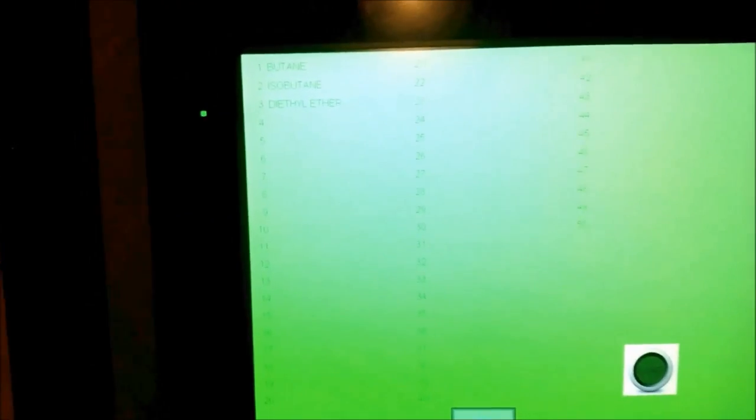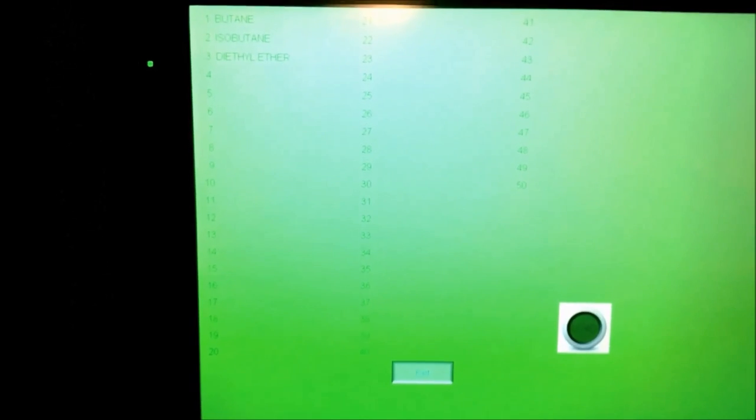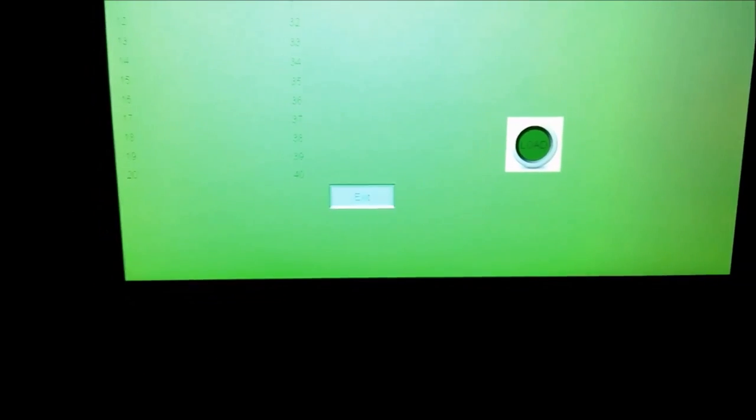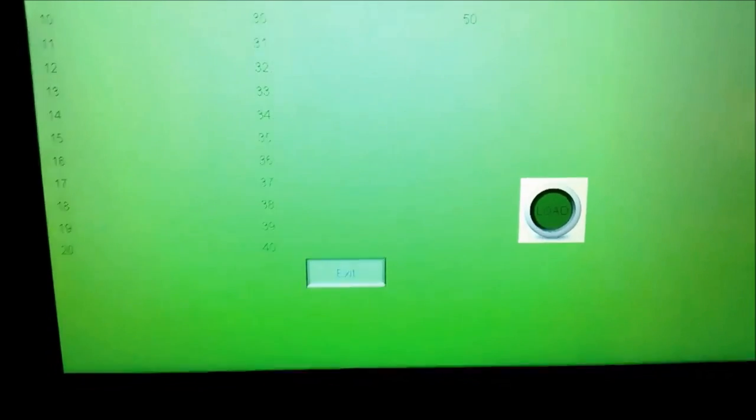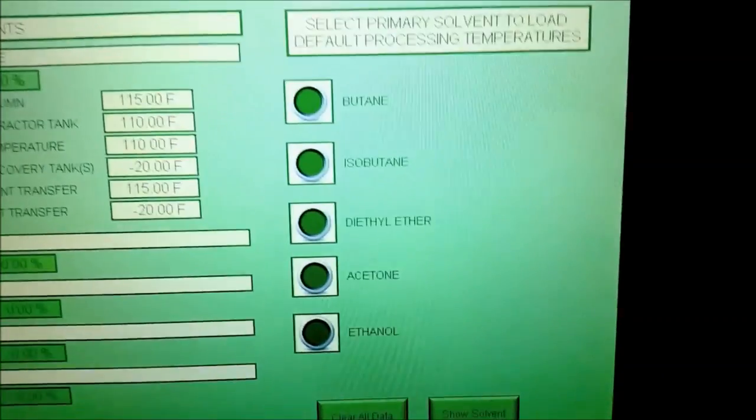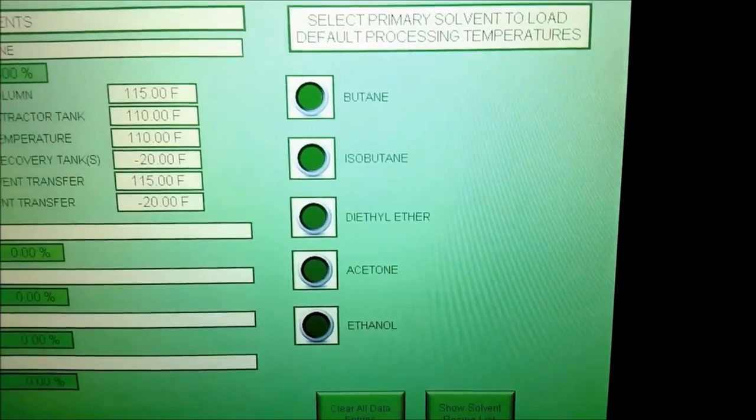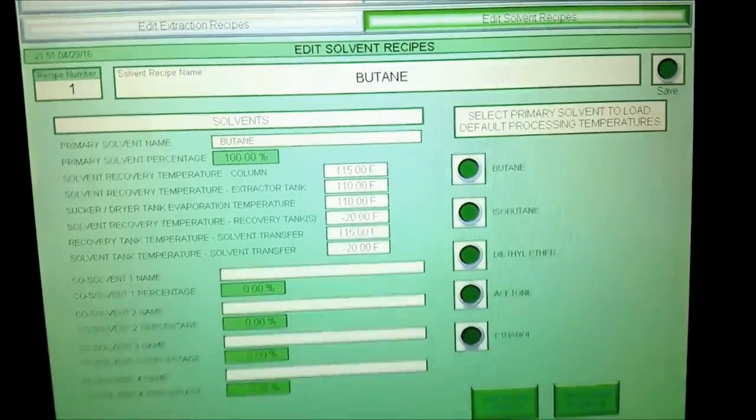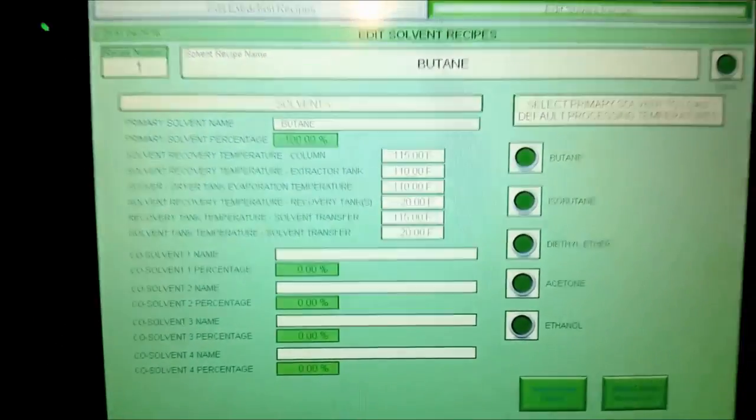All you have to do is enter the solvent and the program already knows what its boiling point is and what it needs to do to transfer the solvent from one tank to the other and perform an extraction recovery. The extraction process stays the same, the recovery process changes obviously with each solvent. These are the five most popular solvents, so they're already pre-programmed into this. You can hit one of these buttons and it'll load all the values that you need for that solvent.